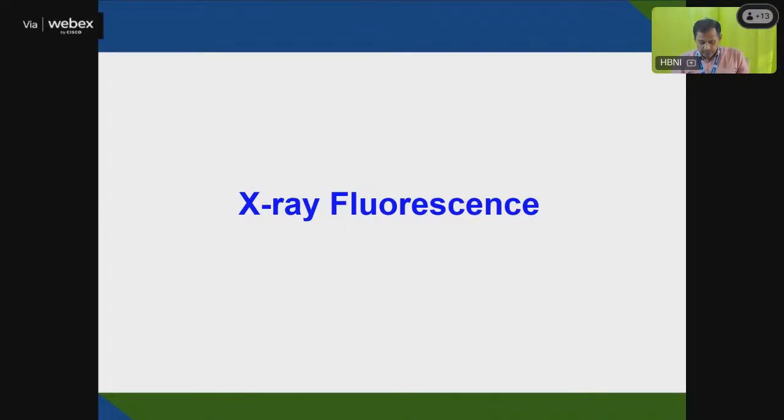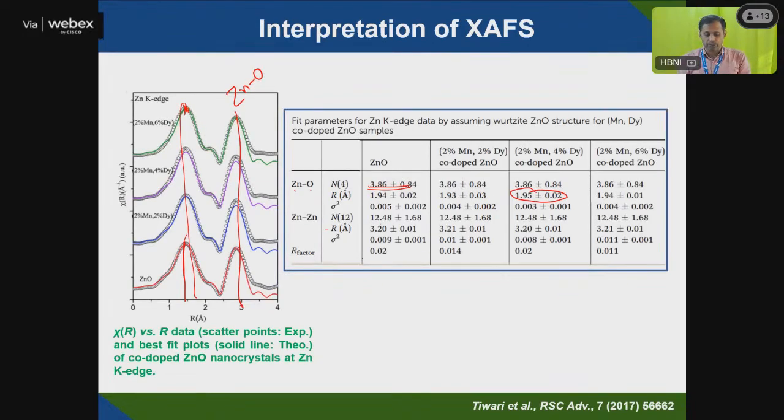Mainly, X-ray absorption spectroscopy is possible only with a synchrotron source. Only when there is a synchrotron source can you do this X-ray absorption fine structure analysis, that is, X-ray absorption near edge spectroscopy or extended X-ray absorption fine structure. Conventionally it's not possible. Conventionally you can do only X-ray absorption spectroscopy to an extent, but for all these absorption studies you need a synchrotron source.